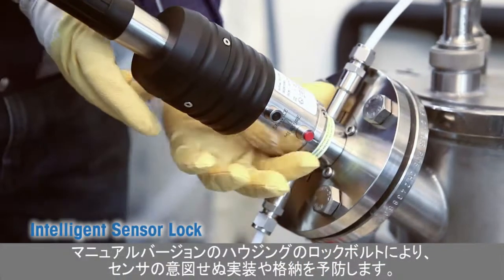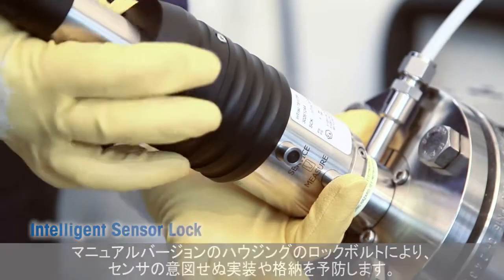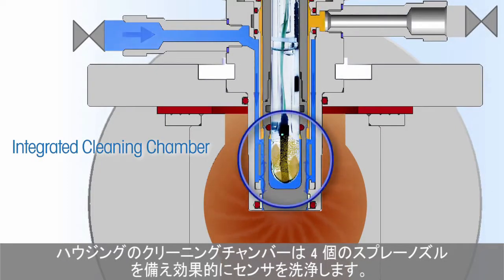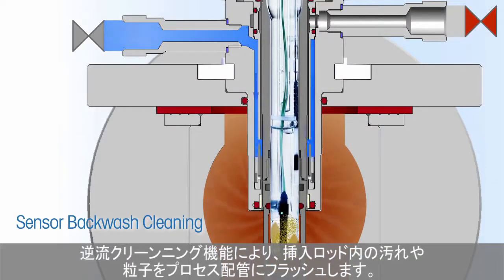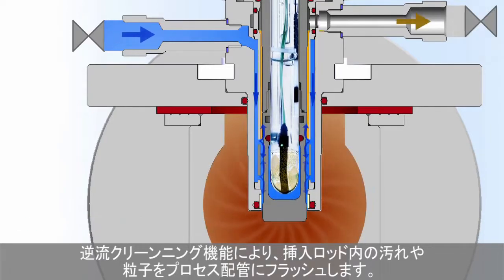Locking bolts on the manual versions of the housings prevent unintended deployment or retraction of the sensor. The housing's cleaning chamber features four spray nozzles for efficient sensor washing. The backwash cleaning function flushes any dirt or particles trapped in the insertion rod into the process pipe.